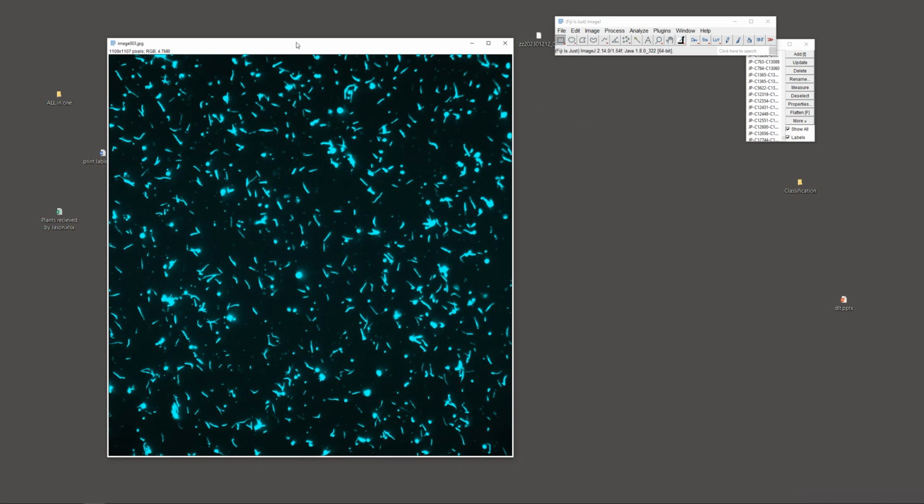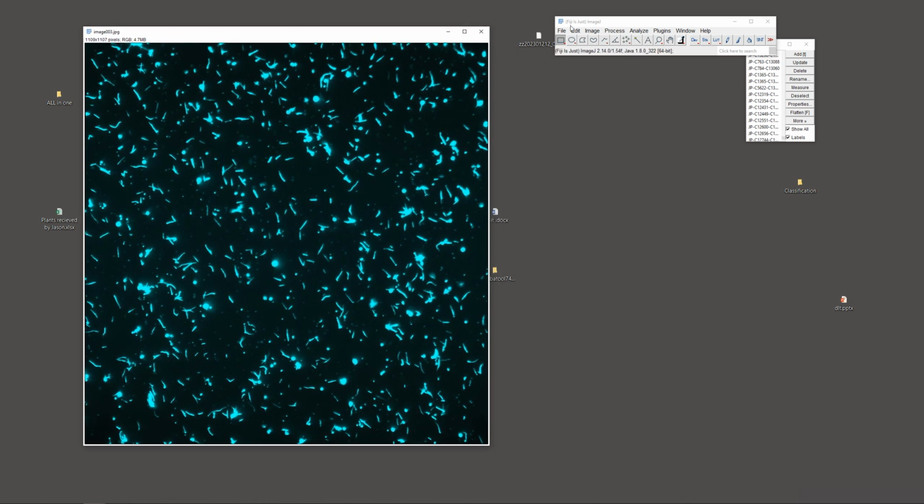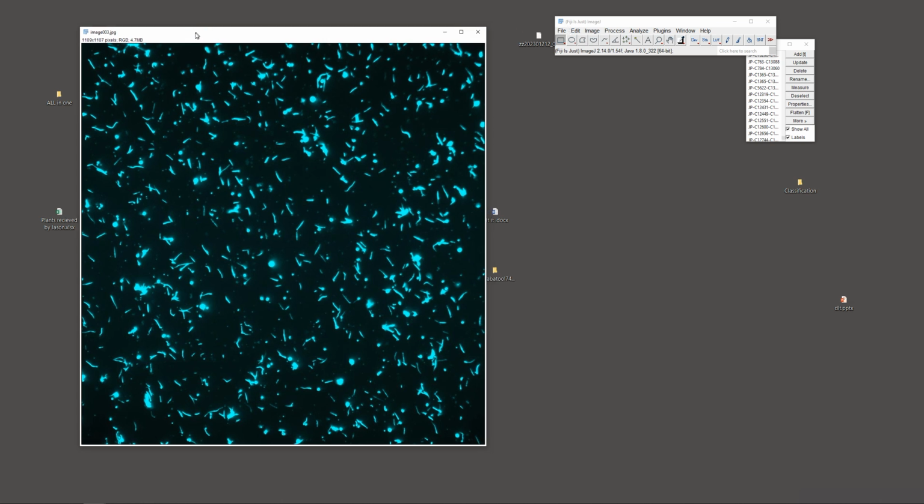So, I have read your email and I want to show you what I can do with these images. First, this image is not in CZI format, which is the original format of an image. That would be better to work with. So, I can start with the image that I have.